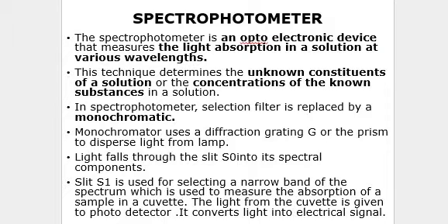You are using this spectrophotometer for identifying the presence of ions in the sample solution. Again, it operates under the principle of an optoelectronic device.